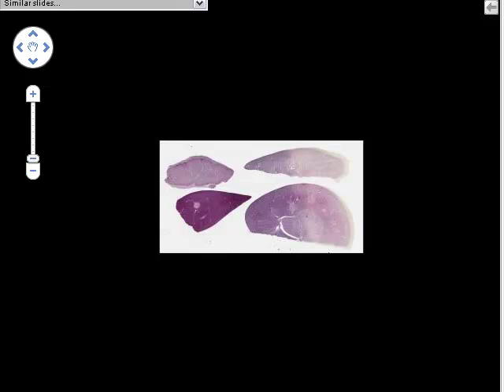Now we're going to take a look at two other simple epithelia. We're going to take a look at simple cuboidal epithelium and simple squamous epithelium, and indeed see some of where these might in fact be in continuity with one another. And really the best place to see simple cuboidal epithelium classically is considered to be in the kidney.